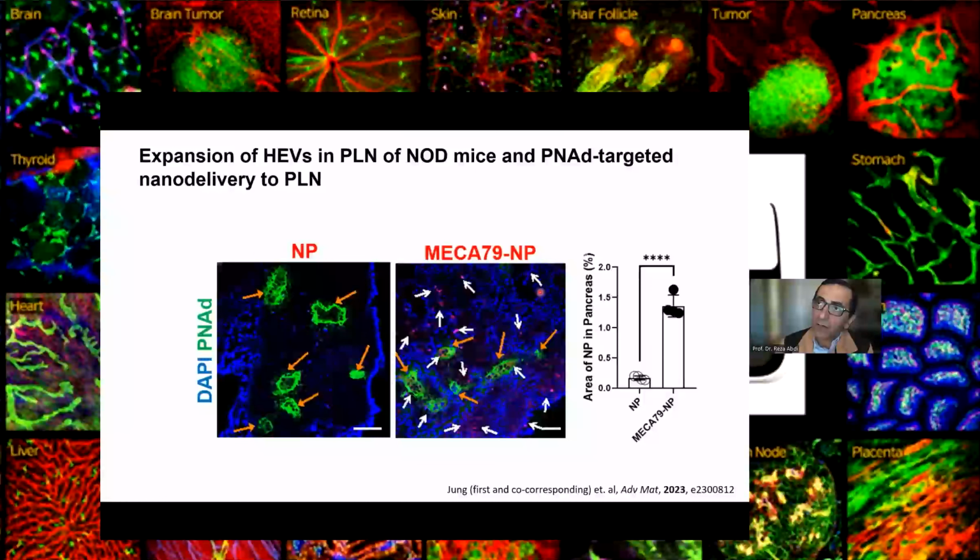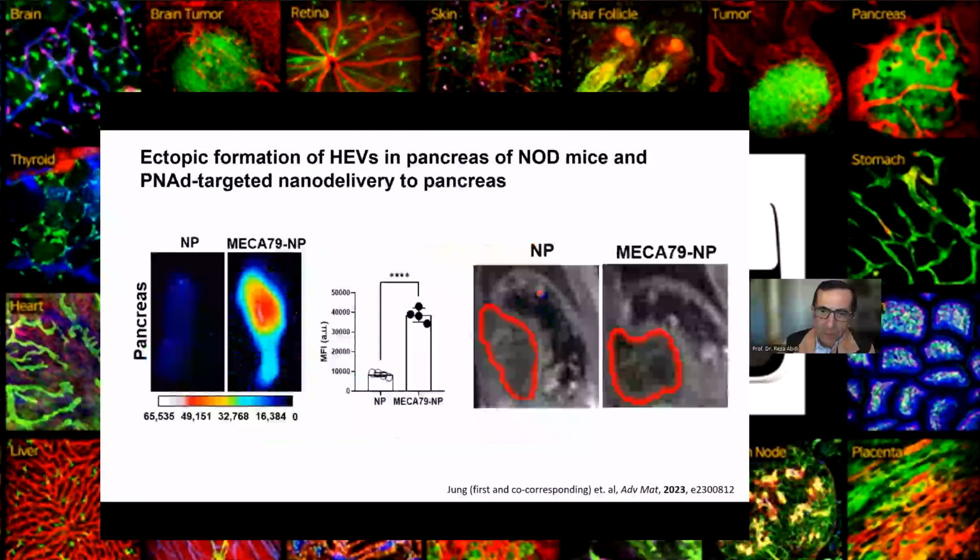I don't know how you would identify those live, but if you can image those islets live with the T-cell drugs, that would be really interesting to us, that we can image the pancreas of this type 1 diabetic mouse over time.